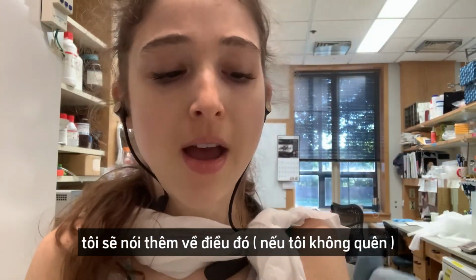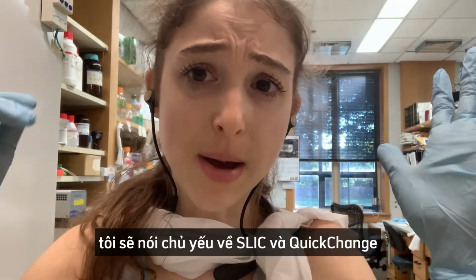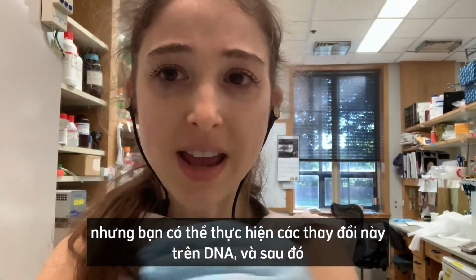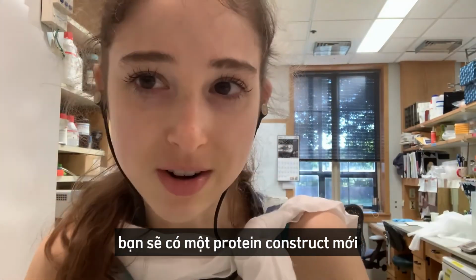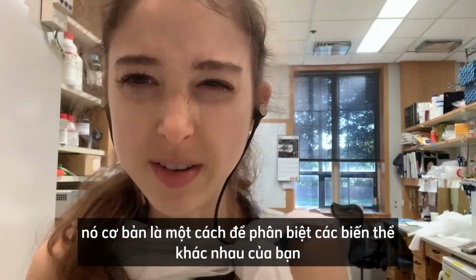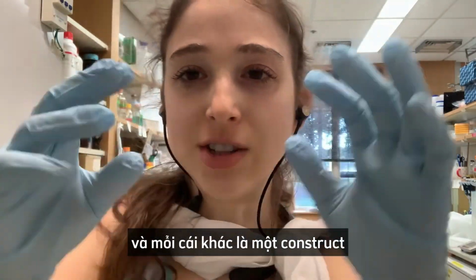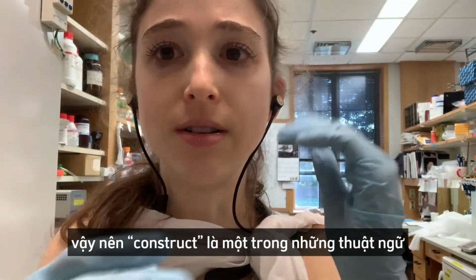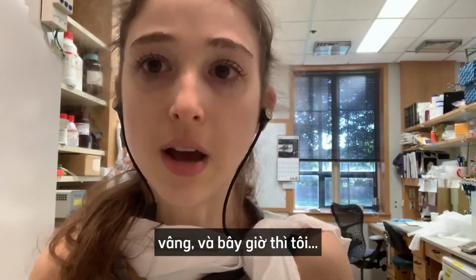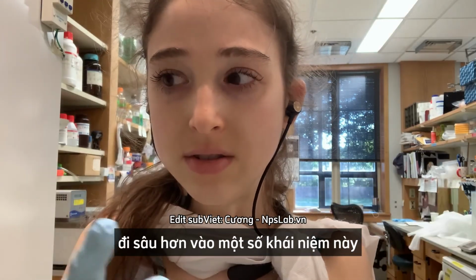But using these techniques I'm going to talk about, mainly SLIC and QuikChange, though there are other methods as well, you can make these changes to the DNA and then you have a new protein construct. It's a way to refer to your different things: the original one is the wild type, and each of the different ones is a construct. Construct is another one of those terms that confused me when I was getting into things. I'm like, what the heck is a construct? And now I have 175 constructs. So let's dive into what some of this is.